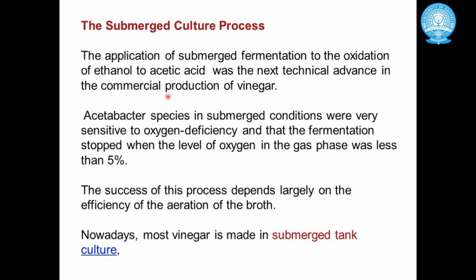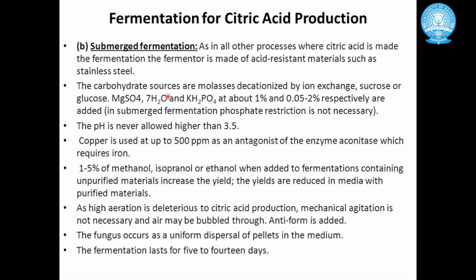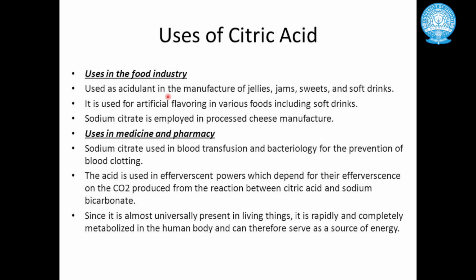You can go through and understand yourself how the submerged culture process is important in submerged fermentation. And this is an example of fermentation of citric acid production. I would request and advise the students to go through this, the biochemical basis of production of citric acid.